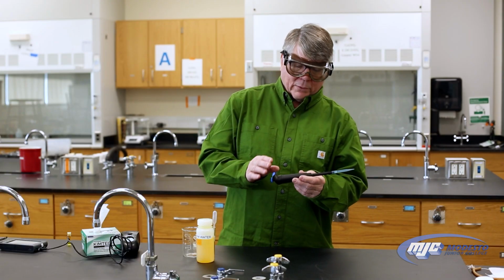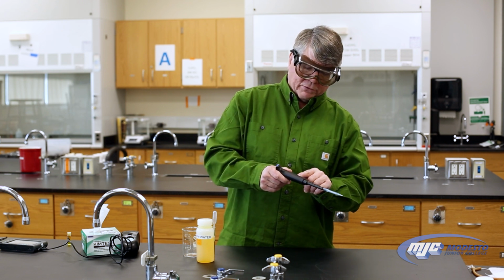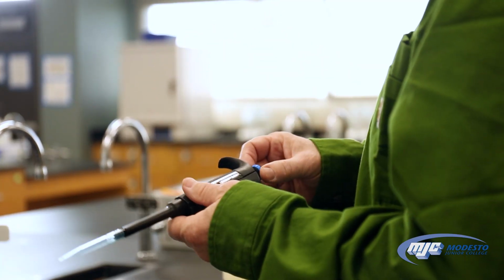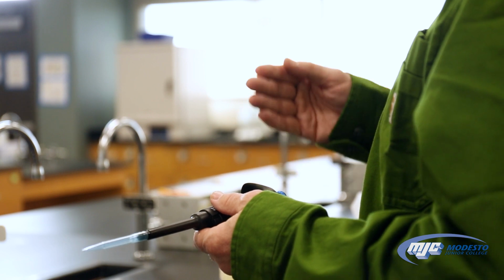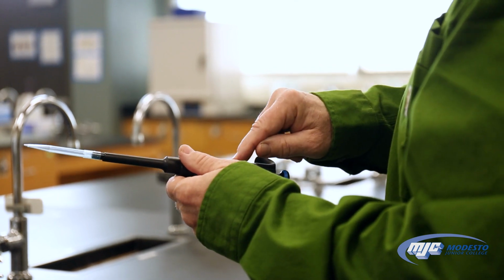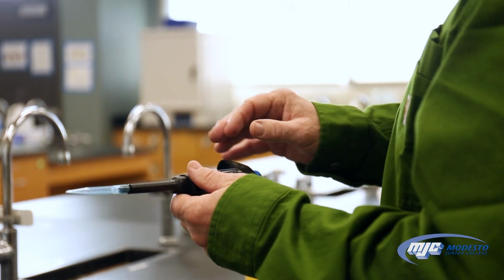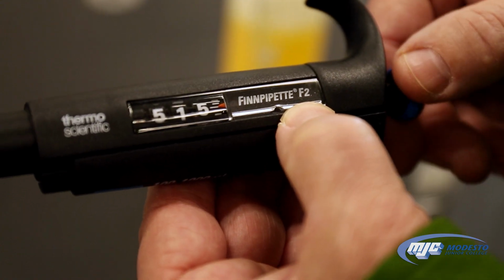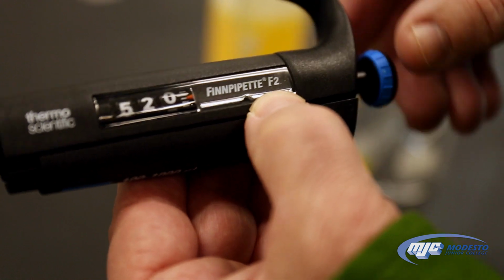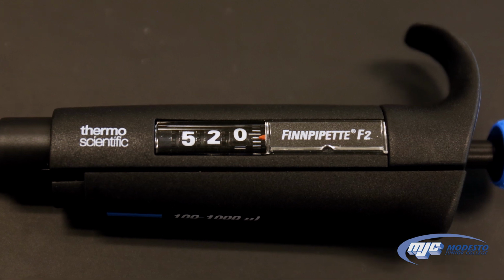So when we're setting the volume that we want to pull up into the tip with the micropipette, we set the volume first by adjusting the number on this scale right here to the volume that we want. So if we wanted to measure 519 microliters or 0.519 milliliters, we turn this knob right here until the red arrow that's in this window would be on 519 before we pick it up, before we pull the liquid into there. So I've been going, there's 5, 10, 15, 16. Each little mark is 1 microliter, 16, 17, 18, 19. So right there is 519 microliters. Now I'm ready to pull the liquid up into the tip.